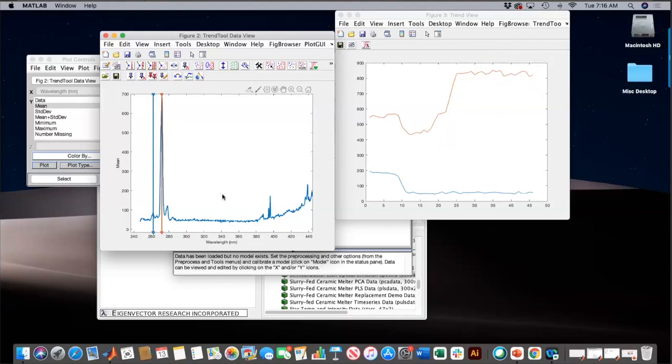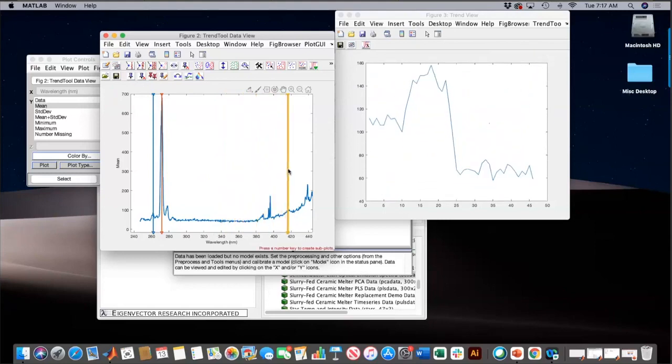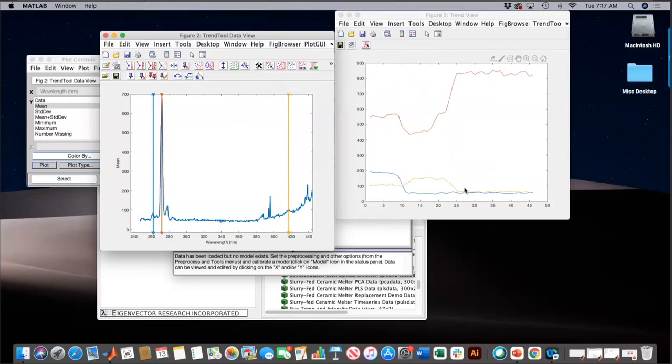And what else might we find in here? Well, I'd only find this because I know what to look for, but there's a little bump over here. And if I look at that, and again, if I click on this and move it around, it's kind of easier to see here. I can see that this looks like maybe it has something to do with titanium etch because it has the characteristic shape of, and it's this one now here, of being of highest concentration when I think the titanium etch is going on. Okay, so this is the basic way to do this.